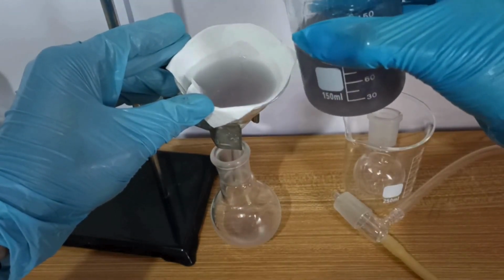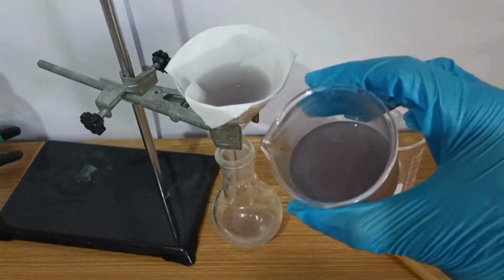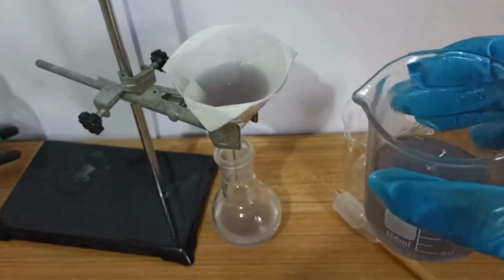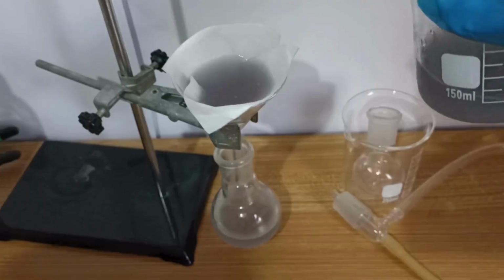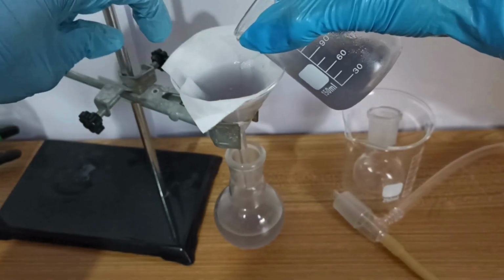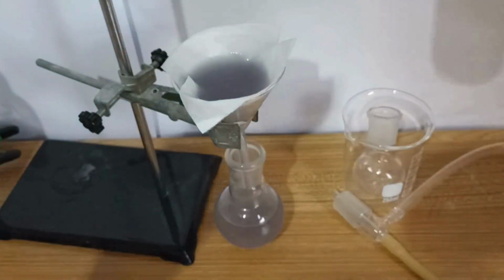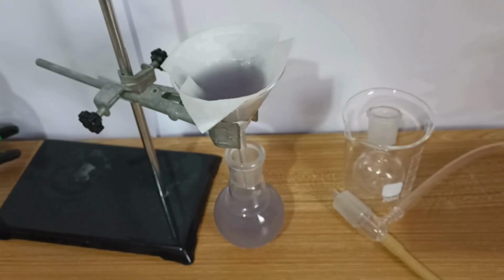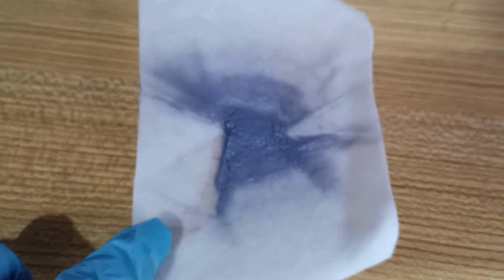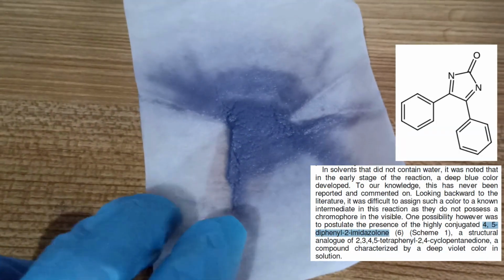Just out of curiosity, I put the filtrate into a freezer for several hours. I got some bluish crystals and I separated them by gravity filtration. I got this nasty purple solid, which is allegedly 4,5-diphenyl-2-imidazolone.